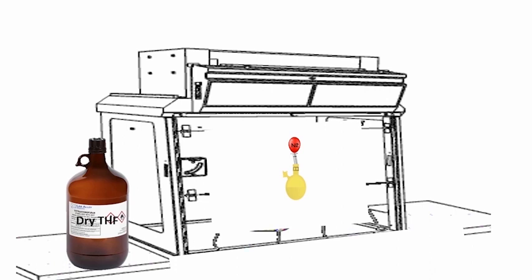When you are putting the reaction with lithium aluminum hydride, the solvent you should use is tetrahydrofuran, THF. The reaction should be kept at zero degrees Celsius, which means you have to use an ice bath.